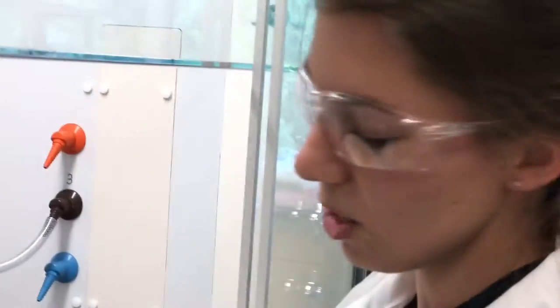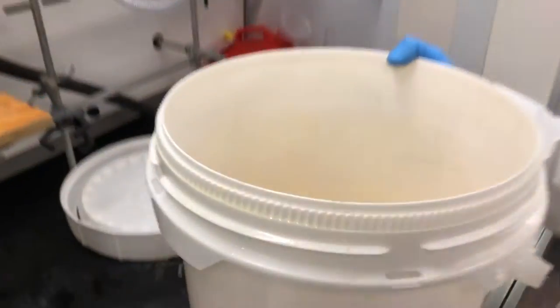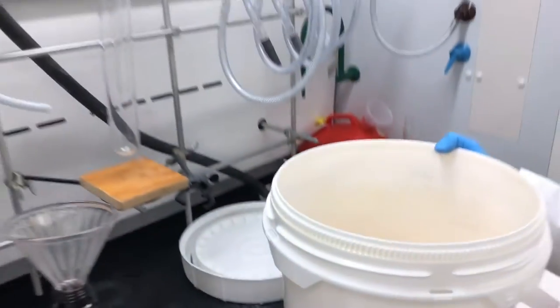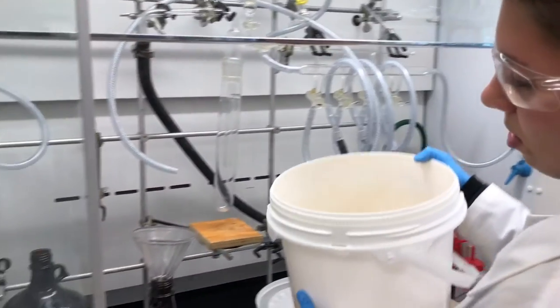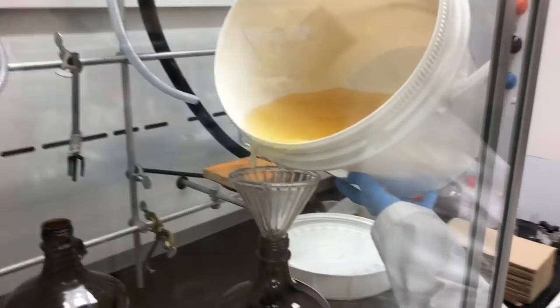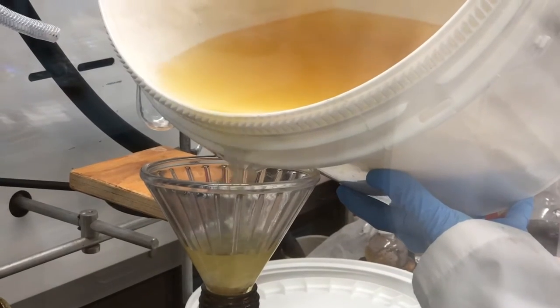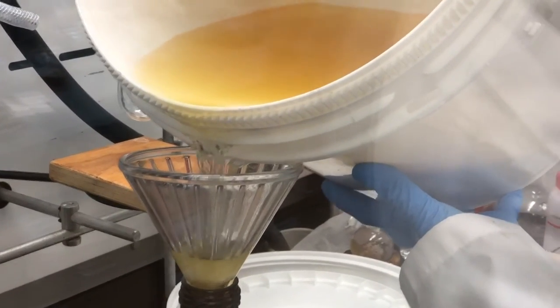You want to swirl the bucket to make sure you get as much potassium hydroxide into the waste container as you can. Make sure you're pouring nice and slow.